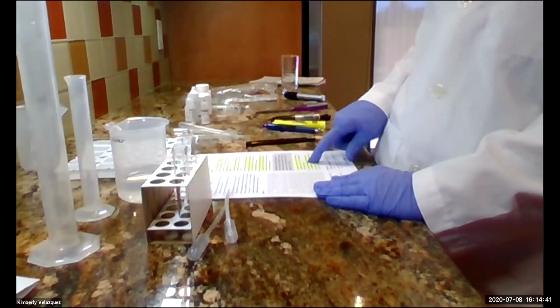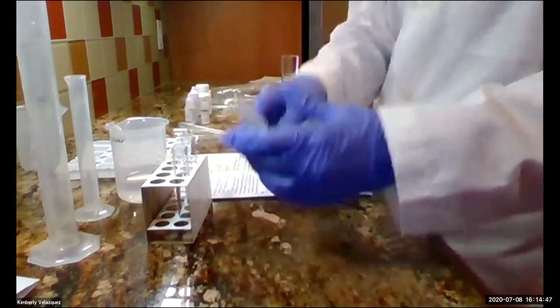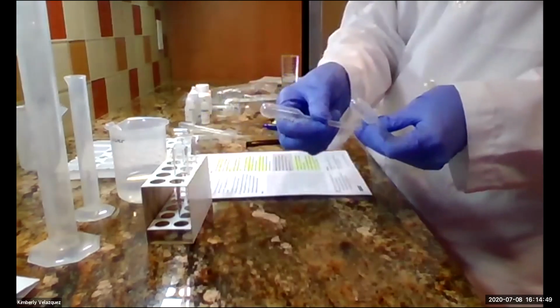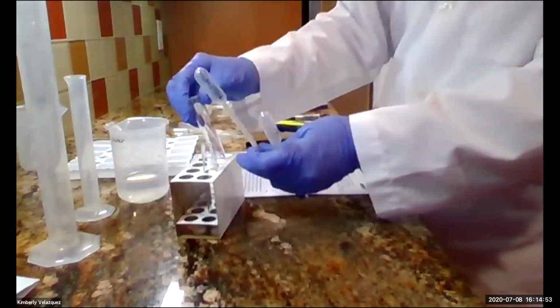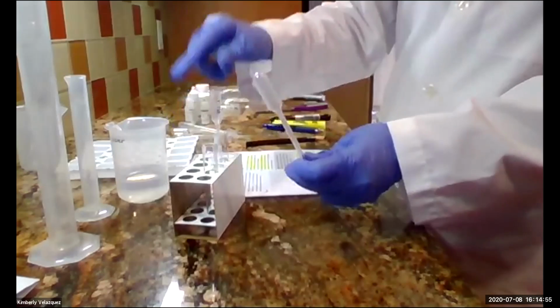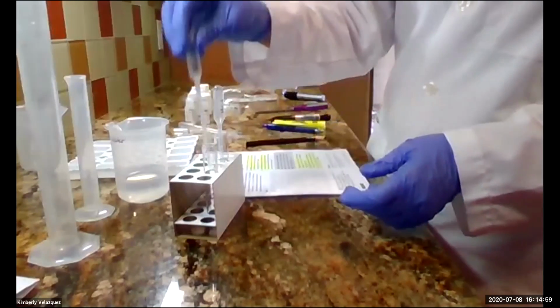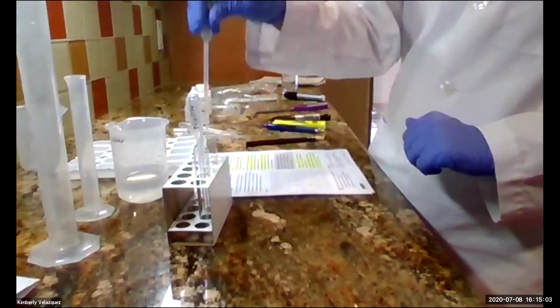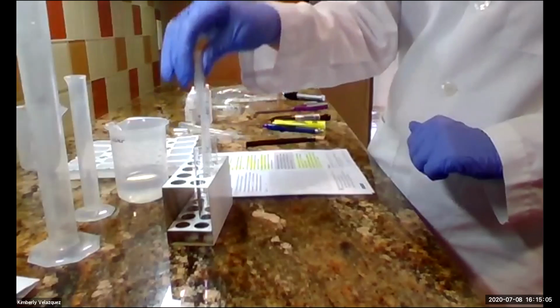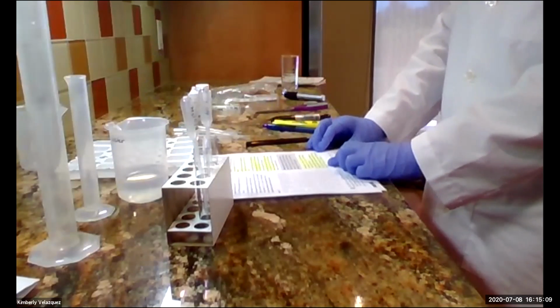Okay, now here we go. Add the sodium hydroxide labeled and hydrochloric acid labeled dropper pipettes to the respective test tubes. What that's asking you to do is take those skinny ones that you labeled, and put the one that says hydrochloric acid in the hydrochloric acid test tube and the one that says sodium hydroxide in this one. You don't ever want to cross-contaminate, so you don't ever want to use the wrong dropper in the wrong test tube.